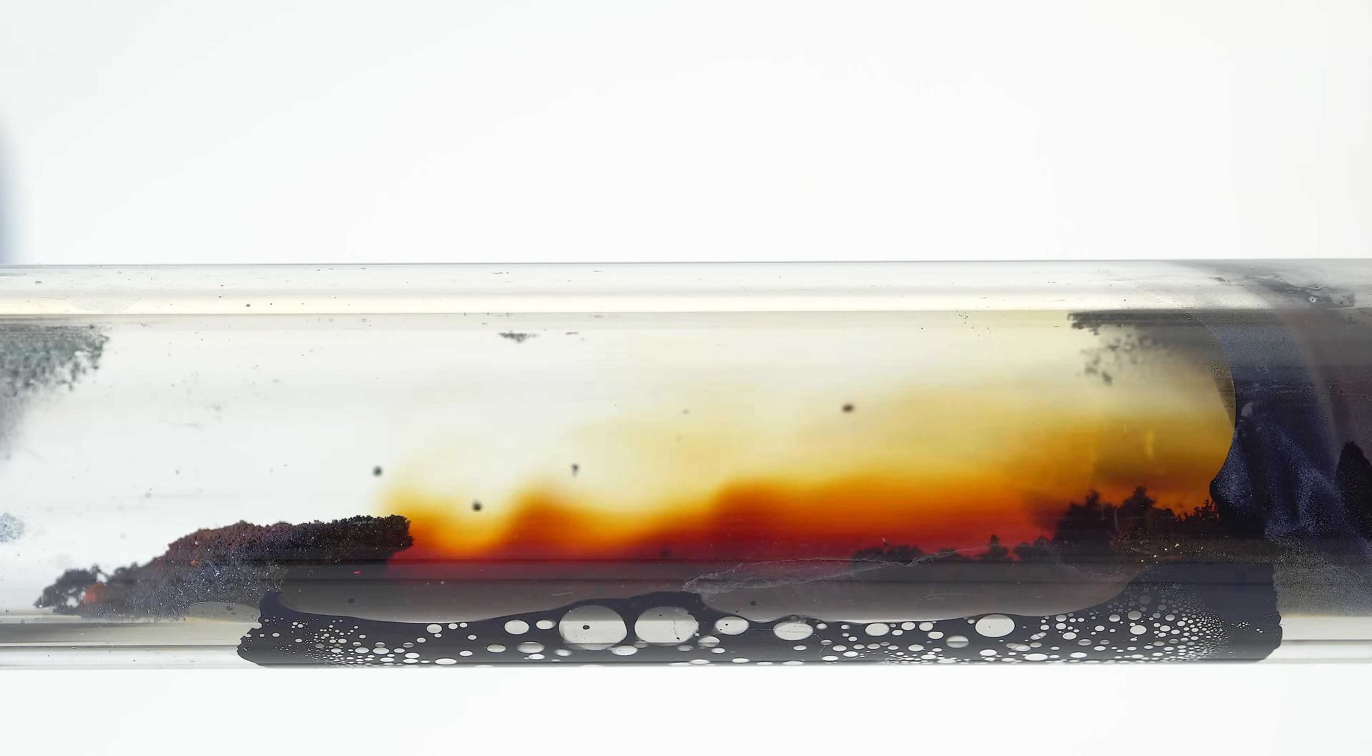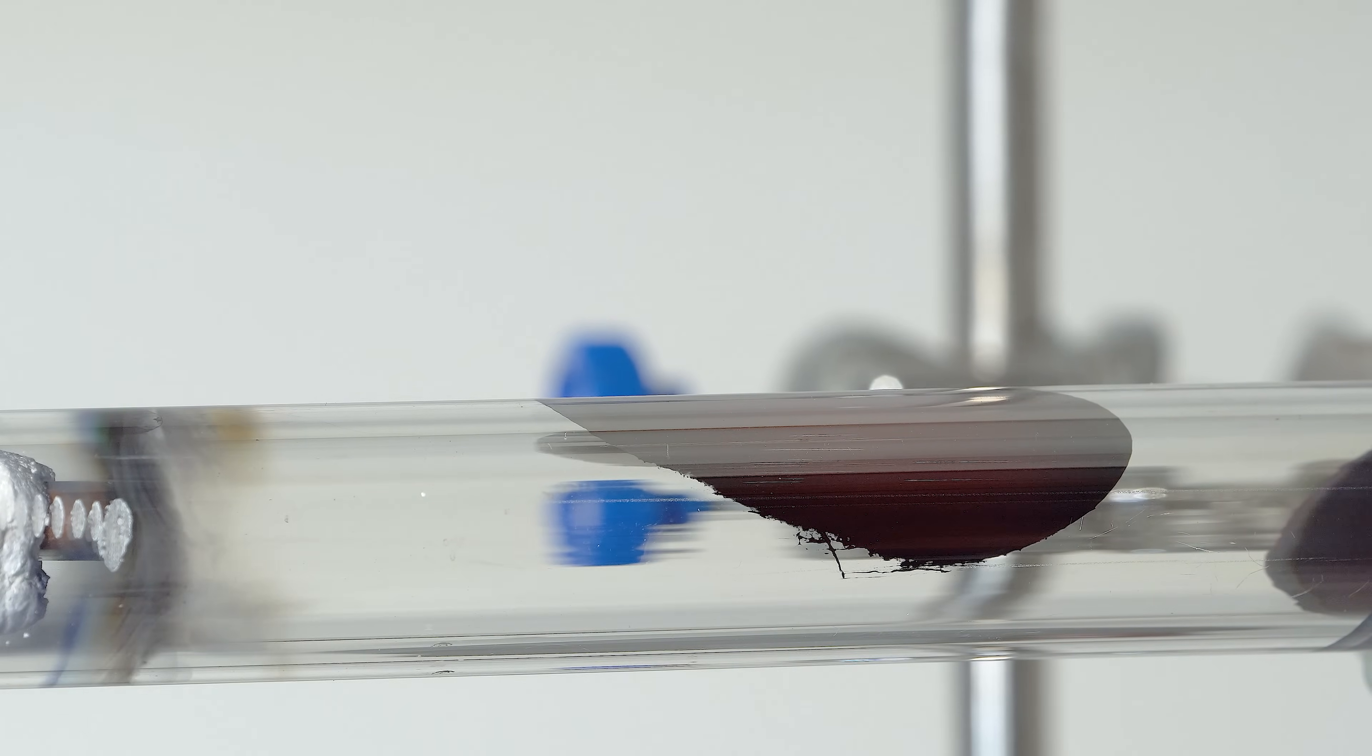Unlike the reaction with tungsten hexacarbonyl, this process generates several by-products that the gas flow carries away. The blue smoke comprises lower tungsten oxychlorides, which readily form upon contact with atmospheric oxygen due to the highly heated chlorides emerging from the tube. Now I am heating only the lower part of the tube, and tungsten is deposited only in this area.